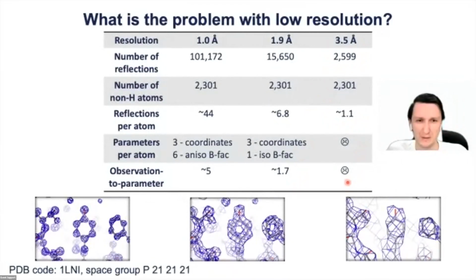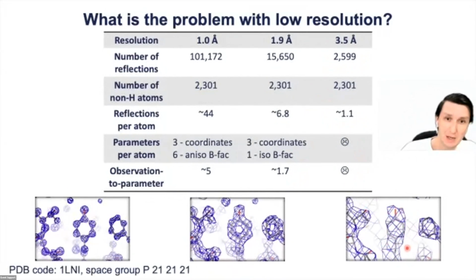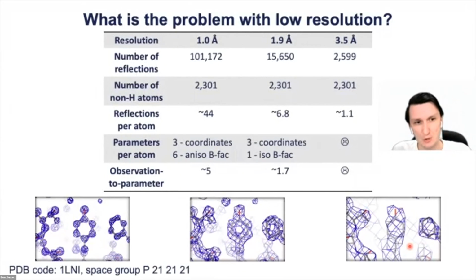Look at this tyrosine side chain. It has 8 atoms. Let us consider these 8 atoms as one rigid body, which means we constrain all bond lengths, angles, planarity, etc. To describe 3-dimensional position of any rigid body, we need just 6 parameters. 3 translations, 3 rotations. That means we need to refine just 6 parameters per group of 8 atoms. So we refine less than 1 parameter per atom.